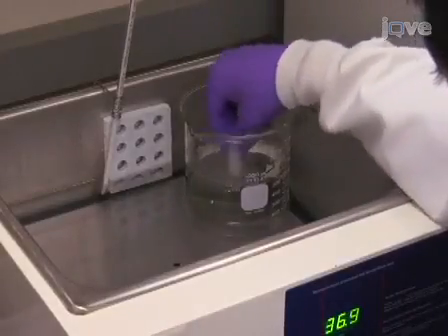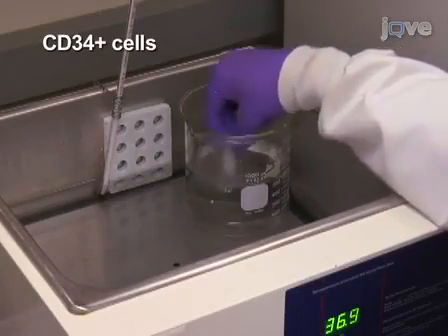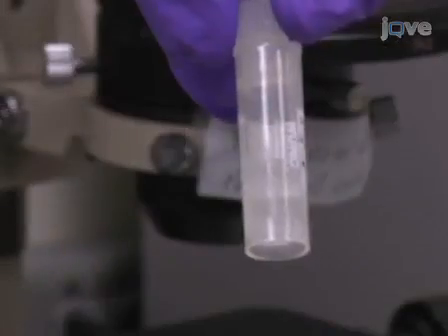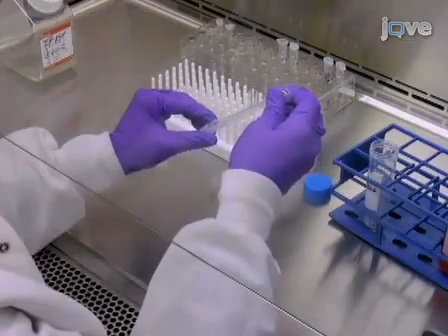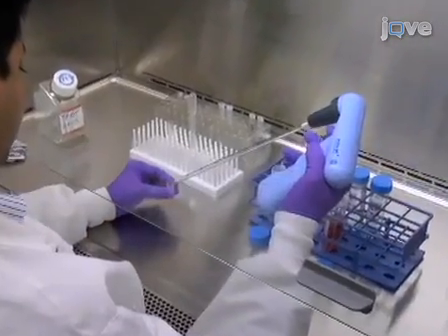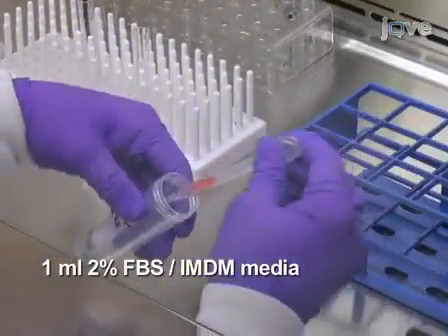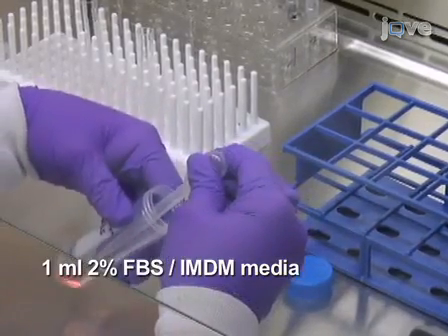In order to seed a culture, quickly thaw a vial of frozen CD34-positive cells at 37 degrees Celsius by gently shaking until a last small ice crystal is left, and transfer the cell suspension to a 50-milliliter conical tube. Gently rinse off the remaining cells from the vial with one milliliter of room temperature 2% FBS IMDM media and add it dropwise to the 50-milliliter tube while swirling gently.